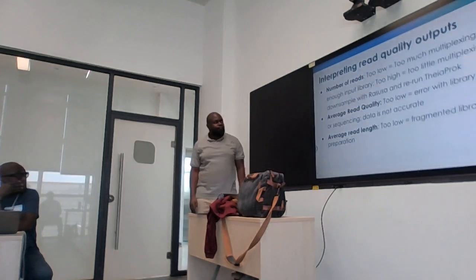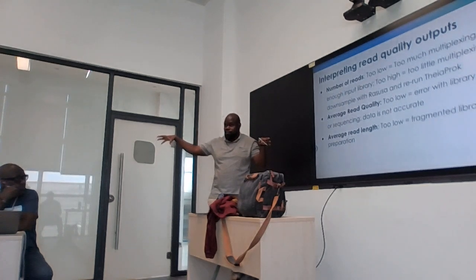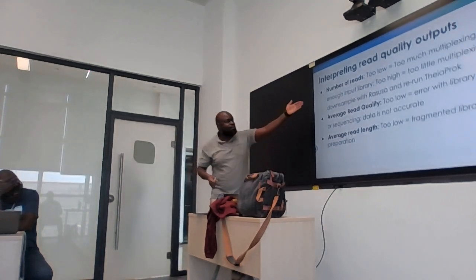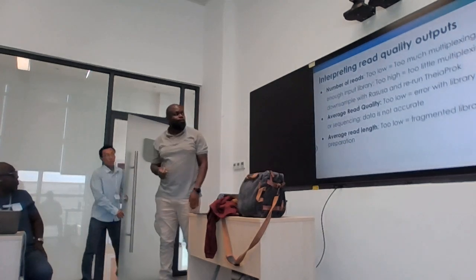Now, always you want to connect the bioinformatics with the lab, right? Because it's important. We want to know if we end up with bad quality because of something that you're doing in the lab, right? So for example, your number of reads is very small. Okay, what does that mean?